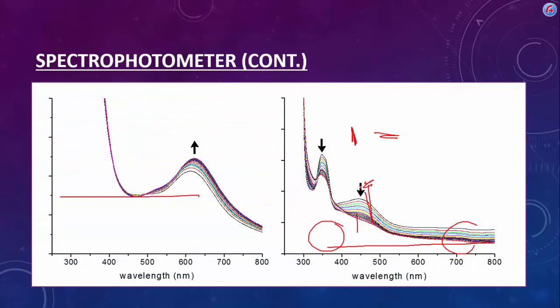Here's another example. Here are two different samples we're looking at. The best place to measure this substance would be somewhere in the 600 to 650 range here, because that's where the maximum wavelength, or the best absorption, will be. And same for these ones. There are actually two different peaks, which sometimes occurs. You could measure here or here, depending on what you're investigating.